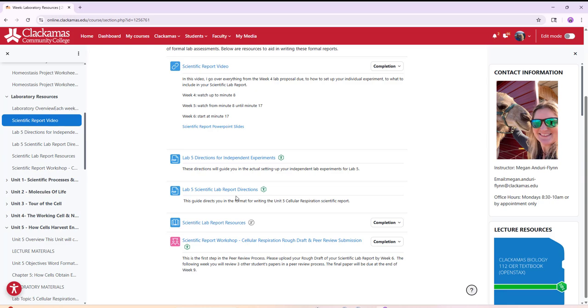Okay, so all of that information is there for you if you'd like that head start. I recommend at least maybe starting to write the method section. So since you are doing the experiment, write down exactly what you're doing, just so that you have that available, and then go ahead and write that paragraph out for your report. Okay?